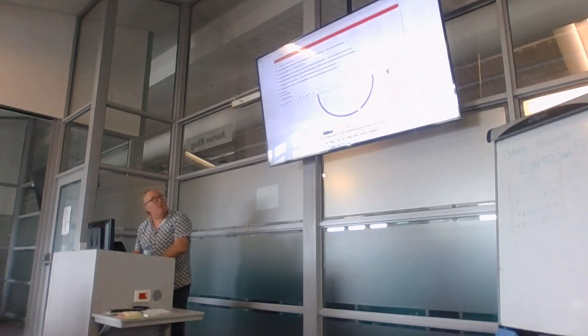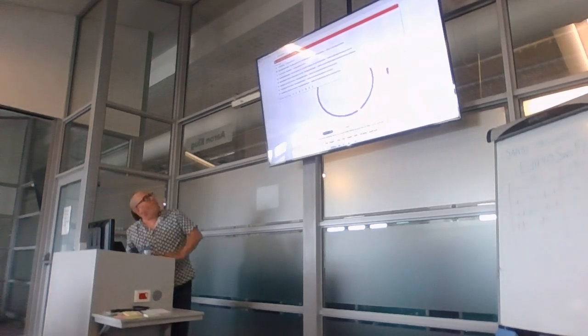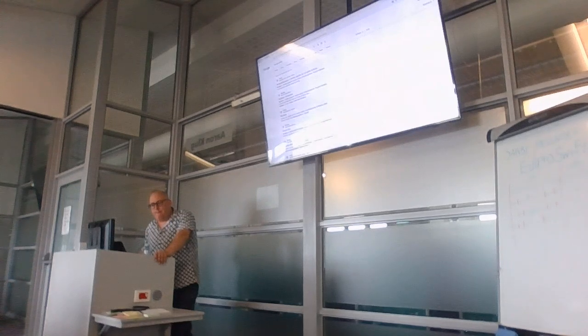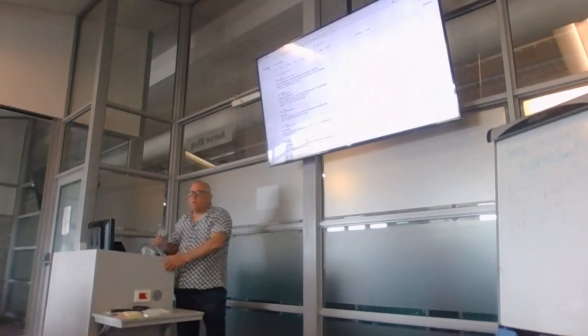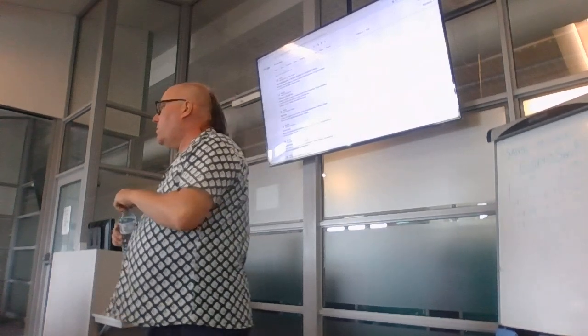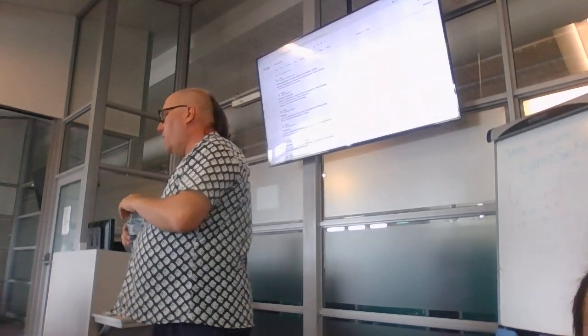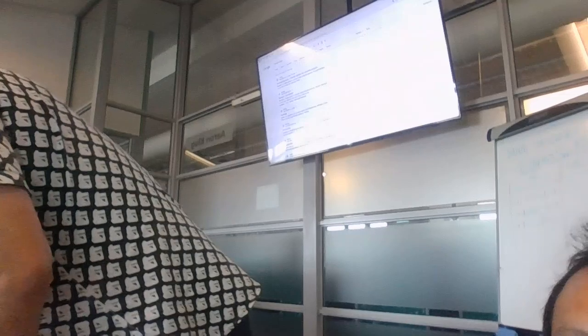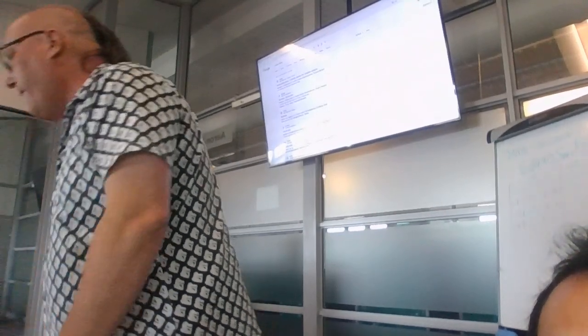Bactopia GitHub. So GitHub is the source code website where you find the Bactopia code. Okay. Bactopia datasets should take quite a while to run for people because it's downloading various things. Is Bactopia datasets working? Is it downloading things for you? No, is it not? What is it doing when you try bactopia datasets? Is your Bactopia working at all? Okay, yours is done. Okay.